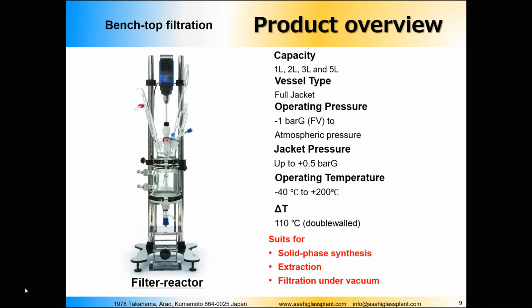The particles of this polymer have a size of, I don't know, 100 microns or maybe 200 microns, depending on the type of polymer you are using. And it is chemically modified, so it looks like, let's say, a head with a lot of hairs on it. The hair is the modified radical.